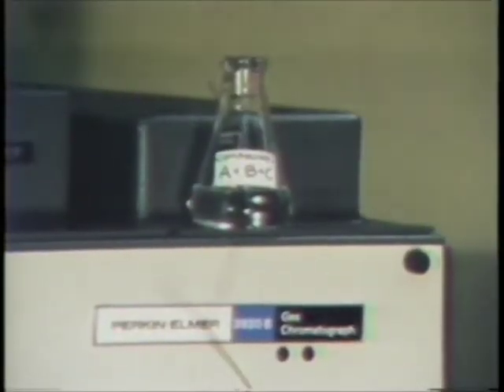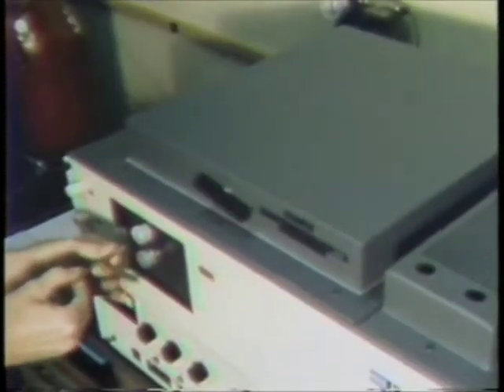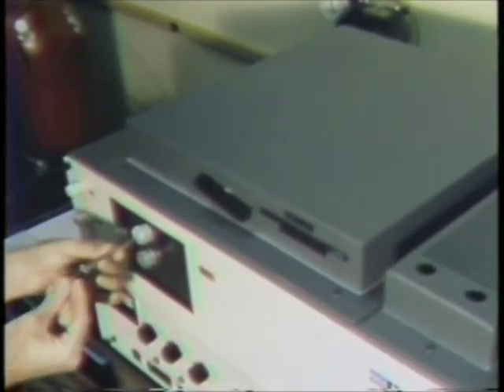Gas chromatography works in a similar fashion, except the separation occurs in the gaseous phase, not the liquid phase. Here, the sample mixture, represented by compounds A, B, and C, is injected into the gas chromatograph using a microliter syringe. Only the smallest fraction of a drop is injected, and it is quickly vaporized.